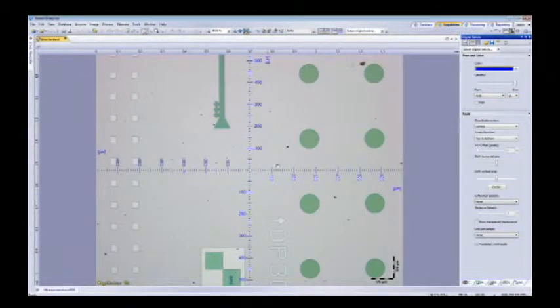Interesting. Okay. So the digital reticle is calibrated when the system is calibrated? Yes, so they know the reticle is accurate. During software install, you're going to put a standard, usually a traceable type standard, on here and calibrate the software. All of your measurements, the digital reticle, the scale bar, everything is based on that calibration. Okay, so measurements are traceable. Okay. Yeah. Turn that off.